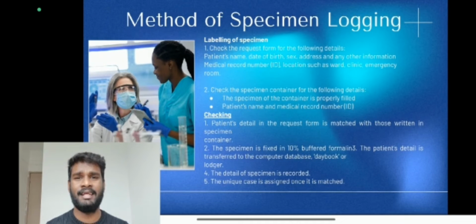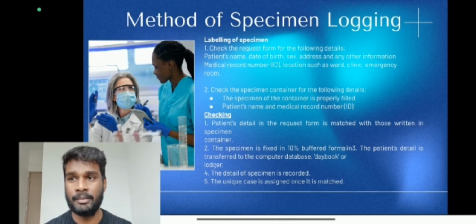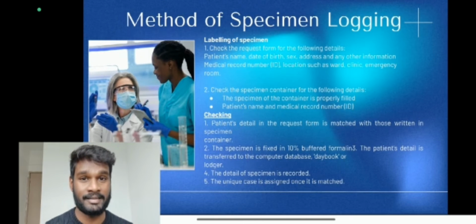Checking is also a very crucial part of specimen logging. This is mainly because it involves matching the patient's details in the request form with those written on the specimen container. The specimen is fixed in 10% buffered formalin, and the patient's details are transferred to the computer database, daybook or ledger. The details of the specimen are then recorded and a unique case number is assigned once it is matched. So that would be all from me for specimen logging.